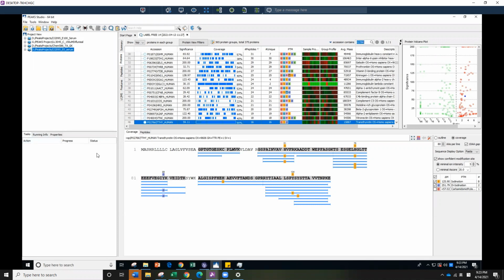You can queue up the project, but your project will not be run until the previous project is finished. So check which one will be more available, with fewer tasks to complete, so that you can get your data sooner.